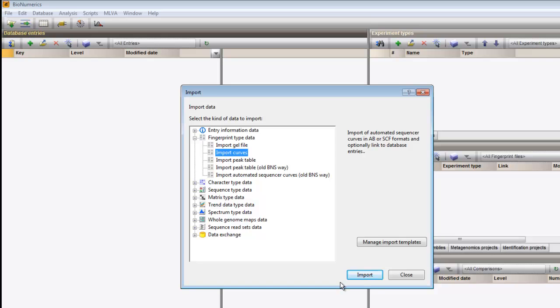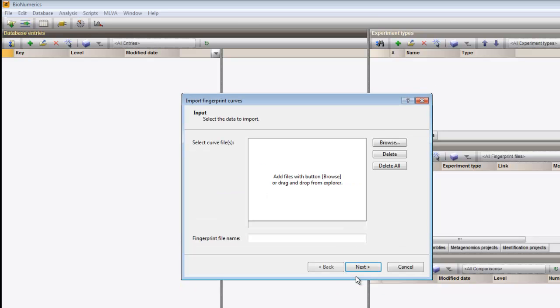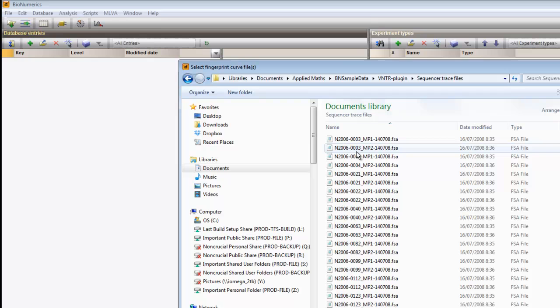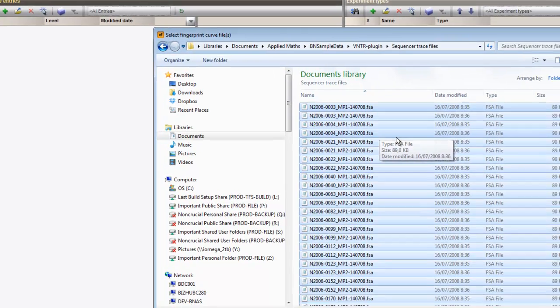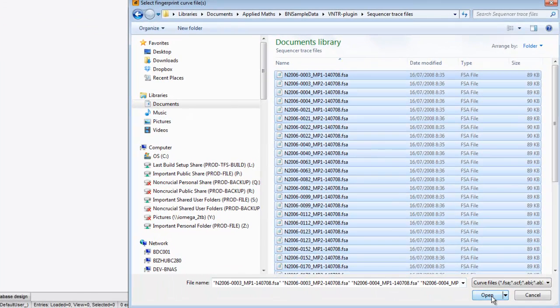Next, we browse for the files, select them, and click Open.